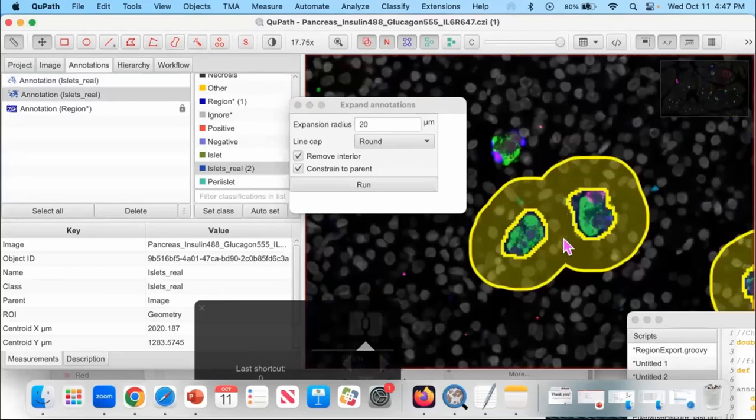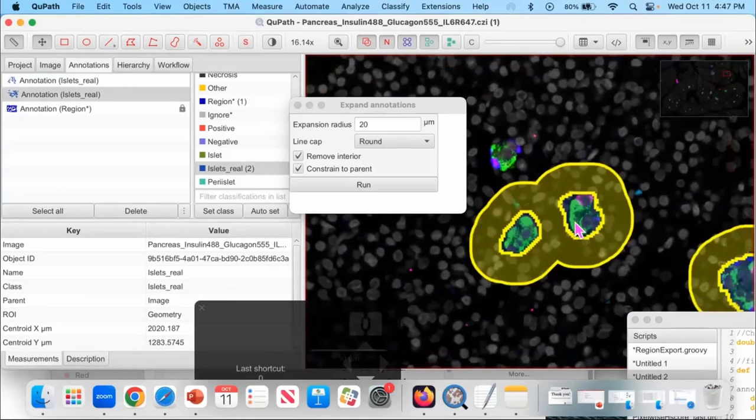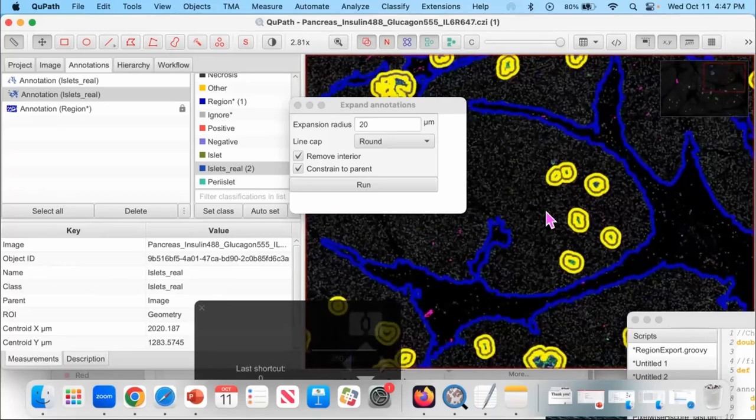You would only ever count these cells once. What you lose in this process is the individual islet by islet results, and which of those is more important is up to you. There's an argument to be made that if these two blobs are so close, they likely are a single islet, that it's just kind of U-shaped and we just cut through it. So what I would actually do, if this were my project, is merge the islets, calculate the peri-islet areas, and then write a script to figure out which for each.